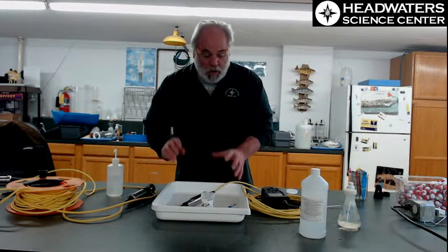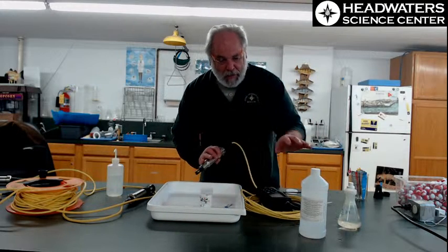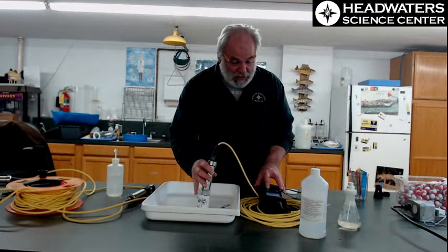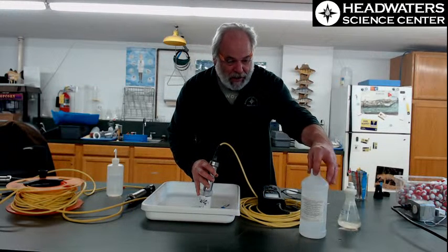Another way that it's talked about is in a term called mhos, but that's just something you might run into. But microsiemens per centimeter, that's relating right on the meter. And again, we're going to check the last time out to see how we did. First thing I do is I read the standard, and the standard should come back at 1,000.